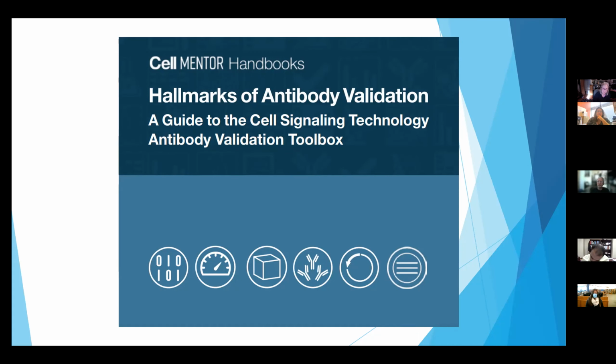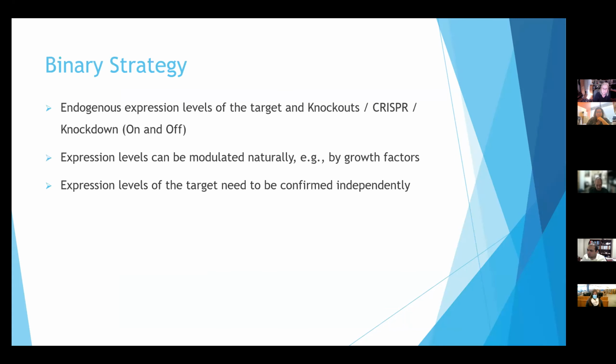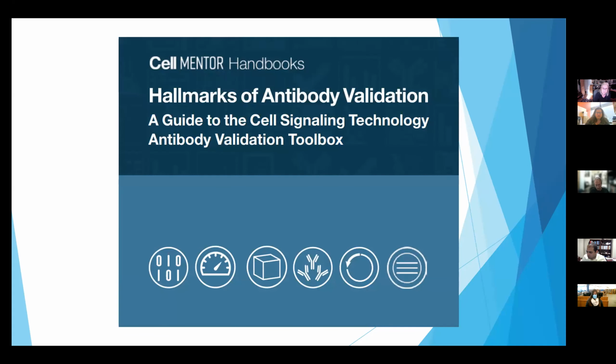So this comes from a very prominent journal by the name of Cell, who is working with a company called Cell Signaling Technology, a very respected developer and distributor of antibodies. And it talks about this in rather plain English, but much more detail than I'm going to provide you right now. Okay, so they provide different strategies, which is what they're trying to symbolize here.